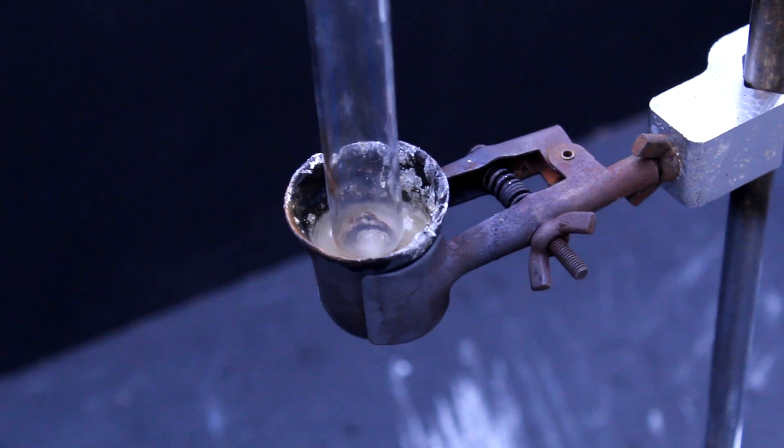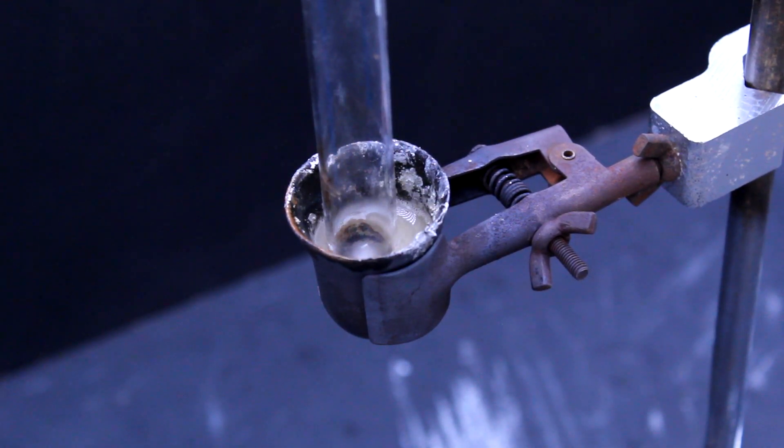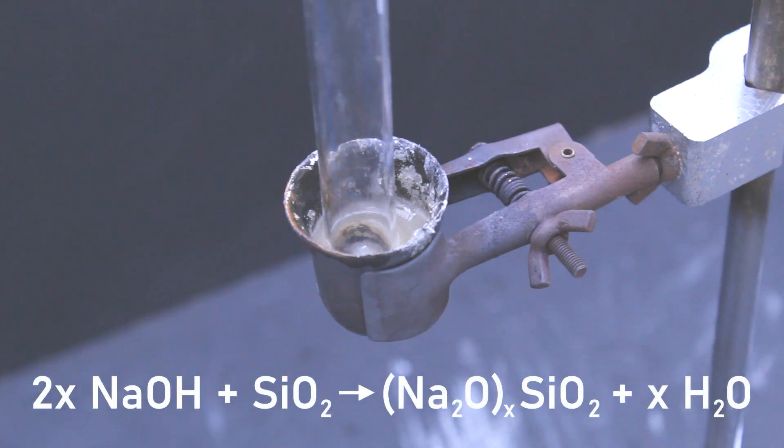Once the sodium hydroxide is molten, submerge the glass you wish to dissolve into it. The sodium hydroxide will now slowly begin to act on the glass, turning it into water vapor and a chemical known as sodium silicate.